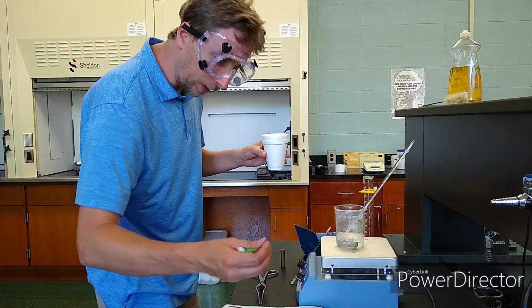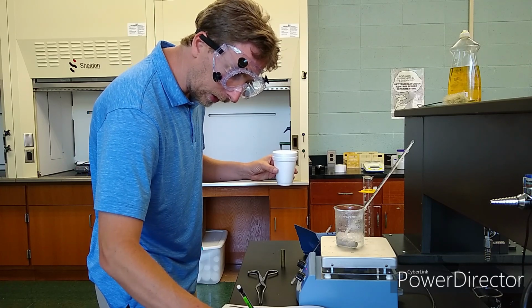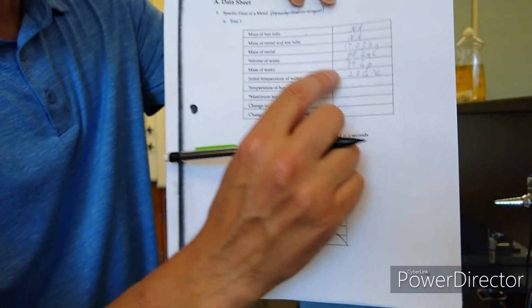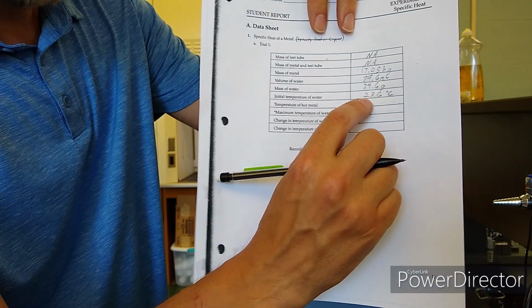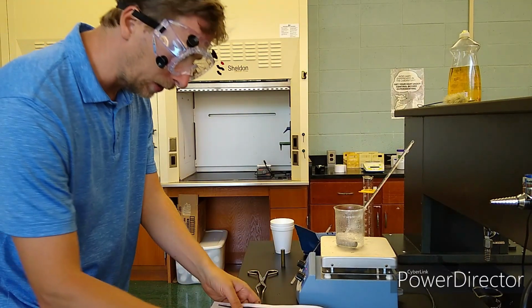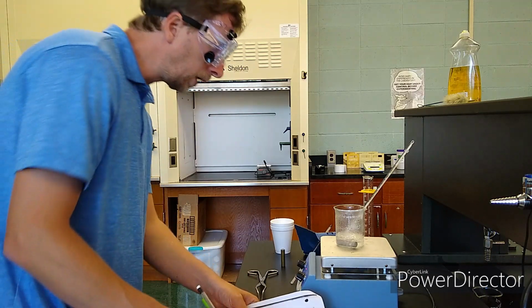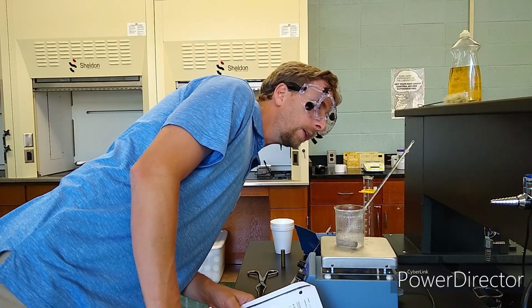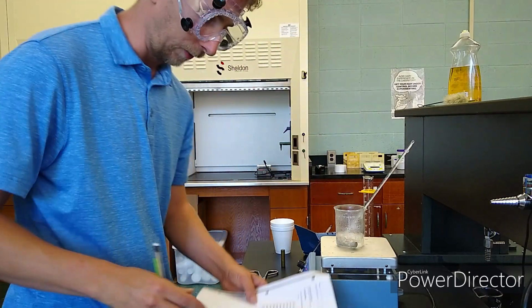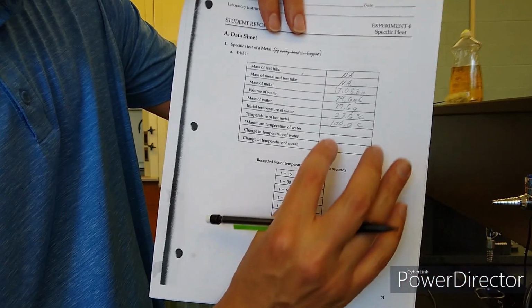Under the initial temperature of water, that's what we just measured. Didn't we say it was 23.6? 23.6 degrees Celsius. So you see right there, 23.6 degrees Celsius is the initial temperature of the water in the calorimeter. The temperature of hot metal is, well, I'm going to put it as 100.0 degrees Celsius is what it's reading on the thermometer here. I don't want to bring the camera over this boiling water. It'll get all fogged up and stuff. So that's the temperature of the hot metal, 100 degrees Celsius. Y'all see that okay, I hope?